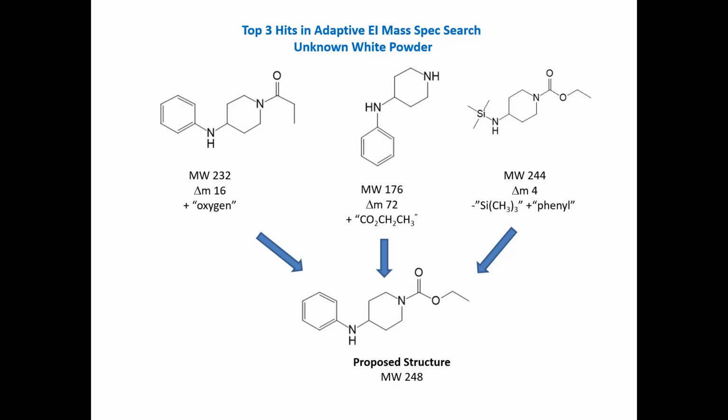On this slide, I've summarized the top 3 hits in the adaptive EI mass spec search for the unknown.